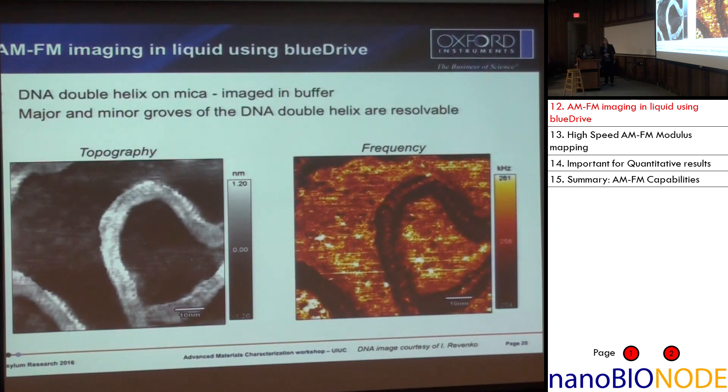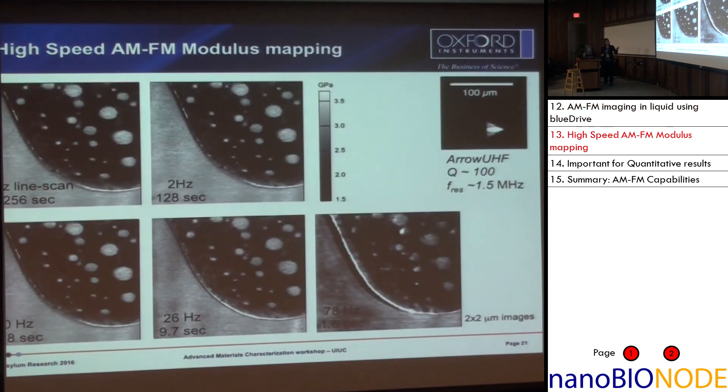This is an image obtained in liquid and it's DNA. It's done in AMFM mode and you can see in the frequency channel we can clearly see the banding of the DNA polymer that was just deposited on the surface.